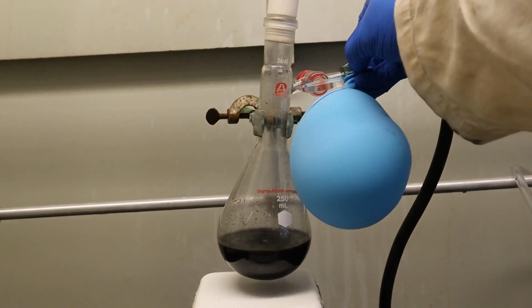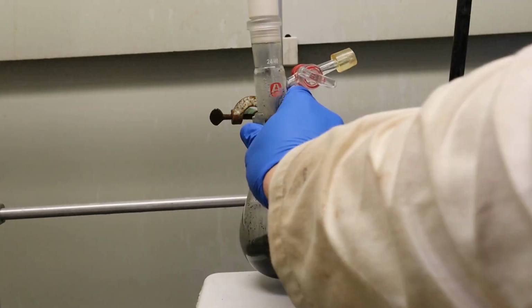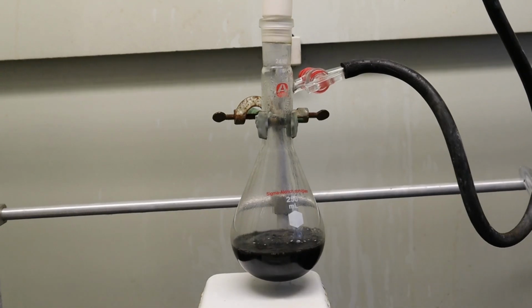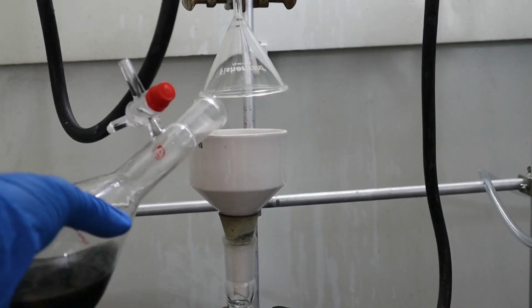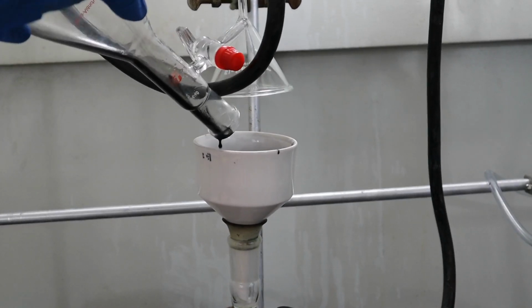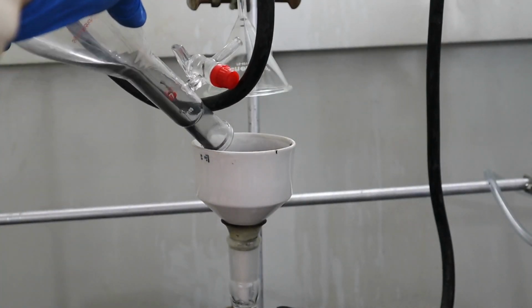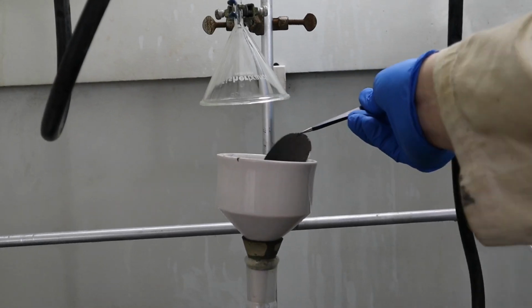The next morning I removed the balloon, almost forgetting to close the stopcock. Fortunately, nothing caught fire. I used the Schlenk line to remove residual hydrogen and refill with nitrogen. The inverted funnel is venting a stream of nitrogen to prevent the pyrophoric palladium on carbon from catching fire. I filtered the reaction and washed everything with methanol to recover as much product as possible. I transferred the filter paper to a jar that I had purged with nitrogen so it wouldn't catch fire.